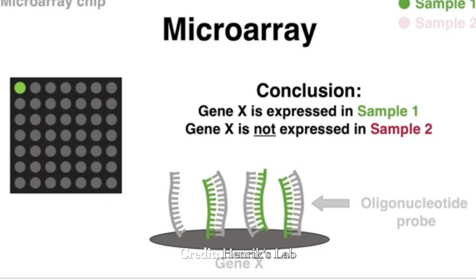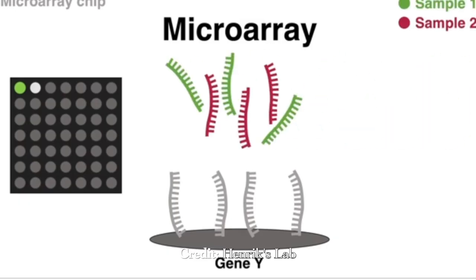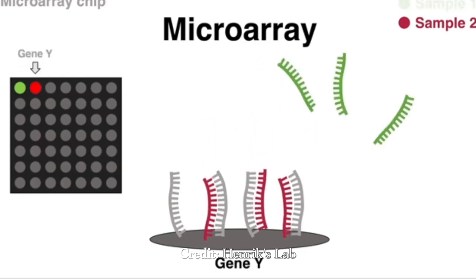So these sequences are complementary. Once again, that's how these principles always work. Whether it's in the northern blot or in the microarray setting, your probes are complementary to the target genes you're trying to detect. After the hybridization, you're going to detect if it's happened.